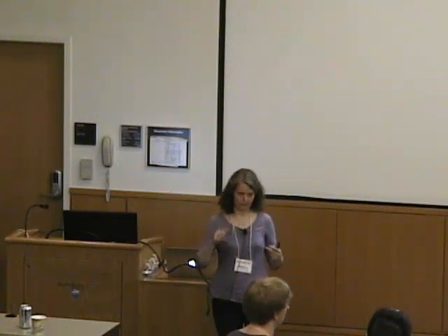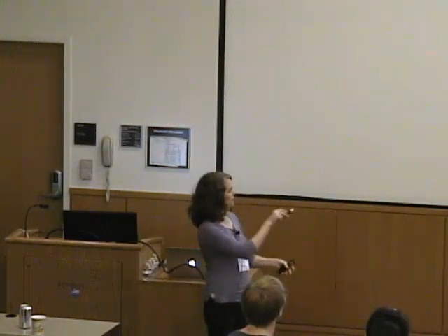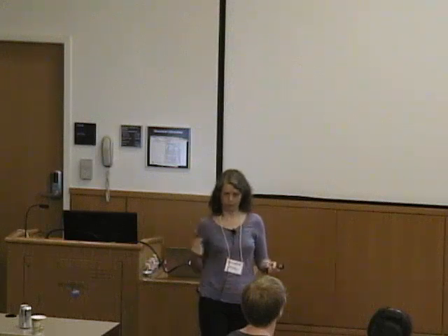Okay. Now when we do our pulse, we're actually tipping this whole precessing cone down into the xy plane, and then we will be able to see that frequency of precession and measure it, and that is going to be reported as our frequency in our spectrum. The signal is measured while it is relaxing. So you apply your pulse, tipping this down, and when you turn off the pulse, that's when you turn on the receiver.